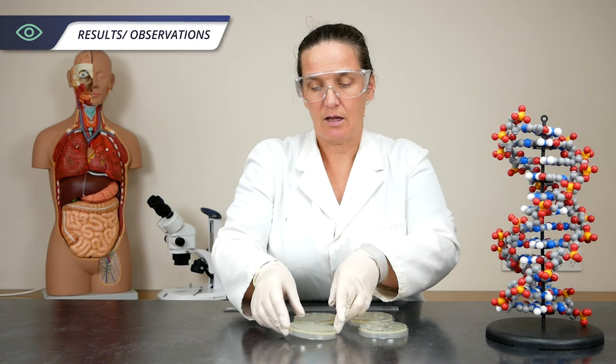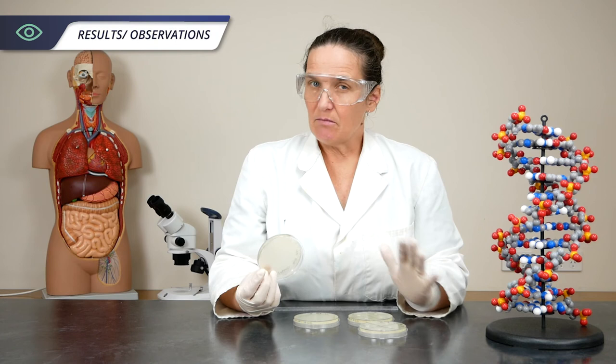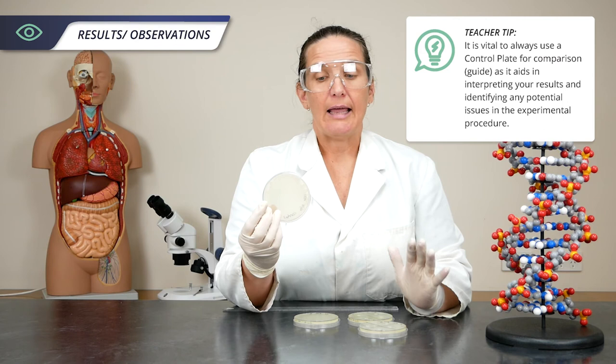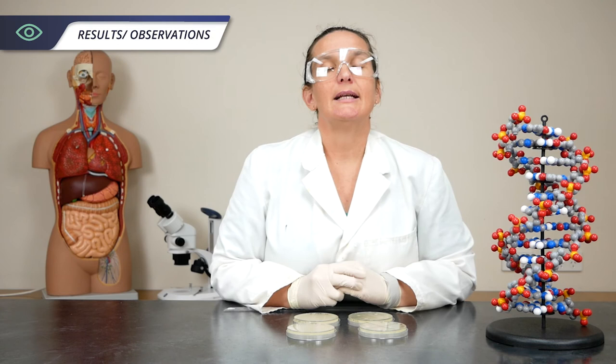Just a quick word about the reason for this control plate, even though we've got a blank disc on this one. If it so happens that you have no growth on your experiment plate, it might be that something went wrong with the growing, or it might be that the antibiotics were really effective and just killed absolutely everything. That's where you go to your control — if there's growth on here then it's the antibiotics that killed it on the experiment plate, and if there's not, then something went wrong in your cultivation.